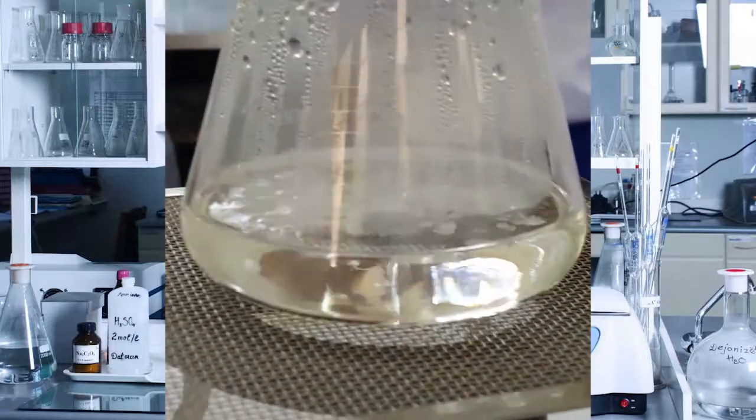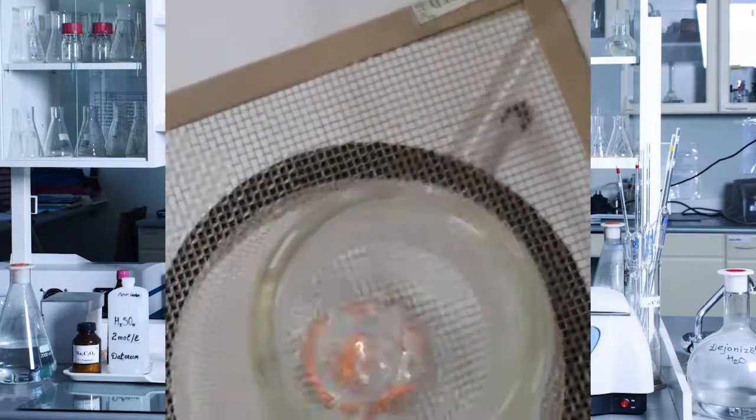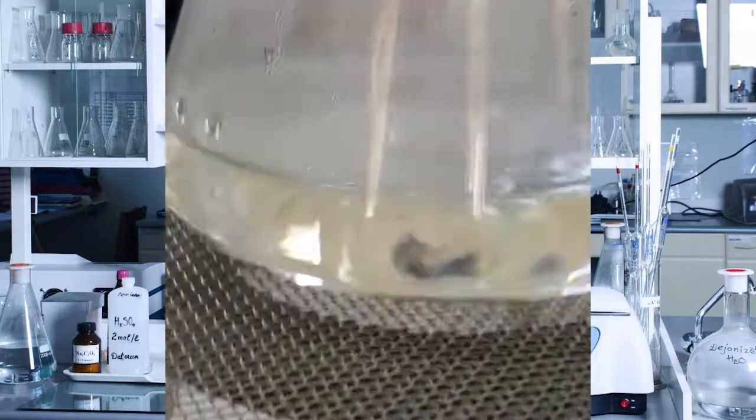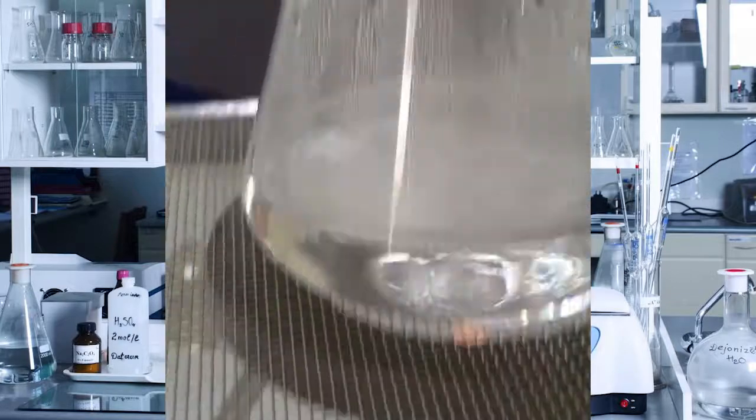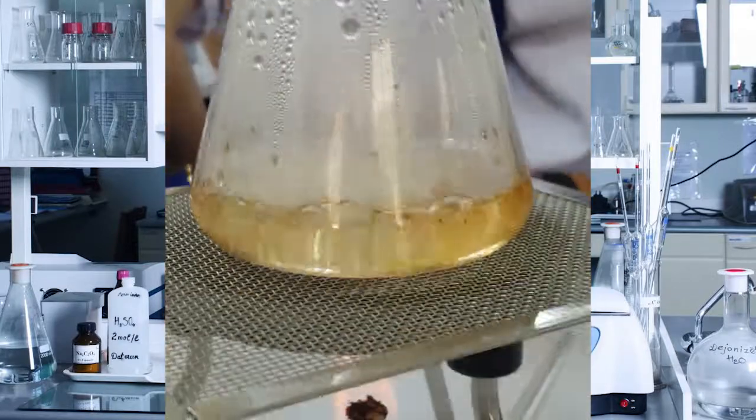In this experiment, we are going to use the boiling water and cinnamon. We mix the cinnamon in the boiling water.